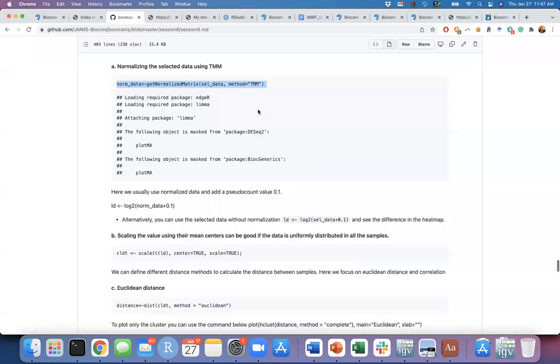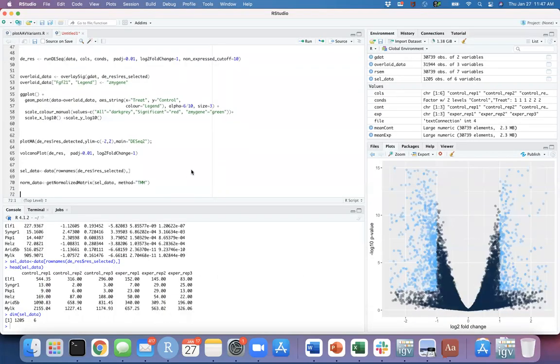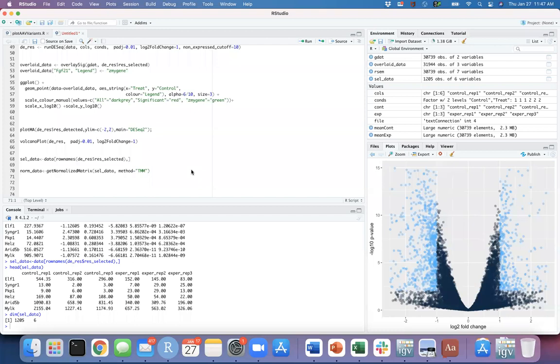But in this case, I don't want to read that second file because this is easier. This is TMM, a different normalization, because some people like TPM, some people use TMM. There are different normalization techniques. TPM is transcripts per million. So when you sum up all the values in the TPM table, the total value will be 1,000,000.